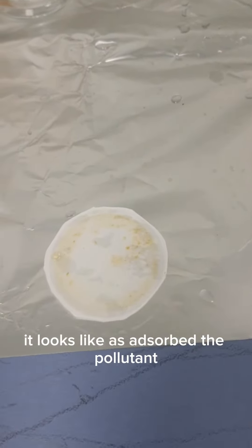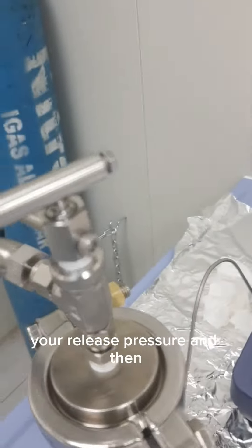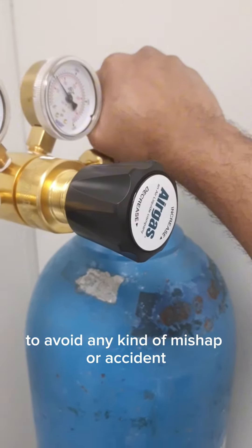After you are done, this is the adsorbed filter — it looks like it has absorbed the pollutant. Also, you have to make sure you have released the pressure, and then you have to close the system from here to avoid any kind of mishap or accident.